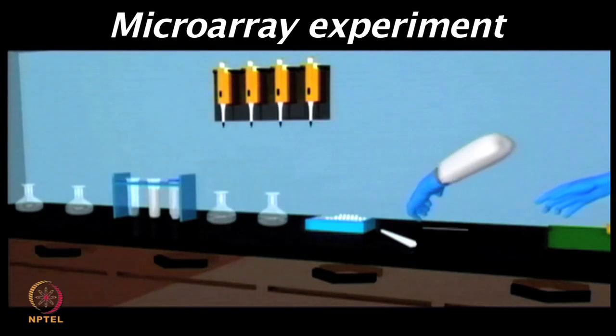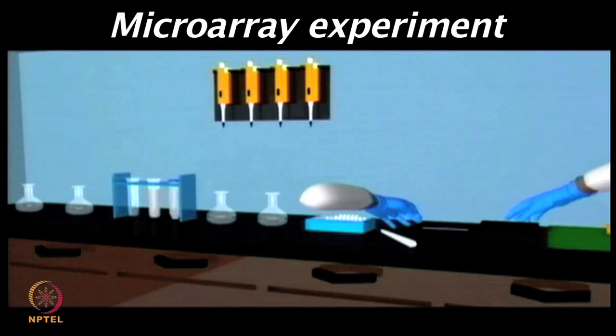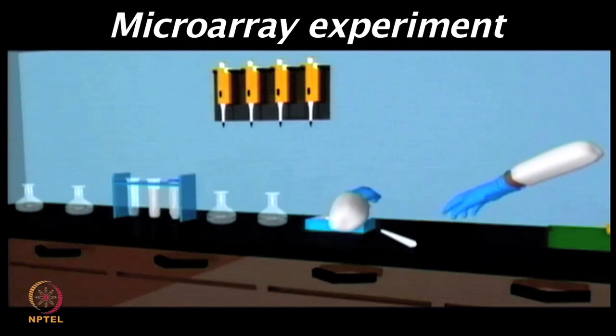A small pipette tip box can even be used for this purpose, where you can add the super block or the blocking solution and then immerse the slide.